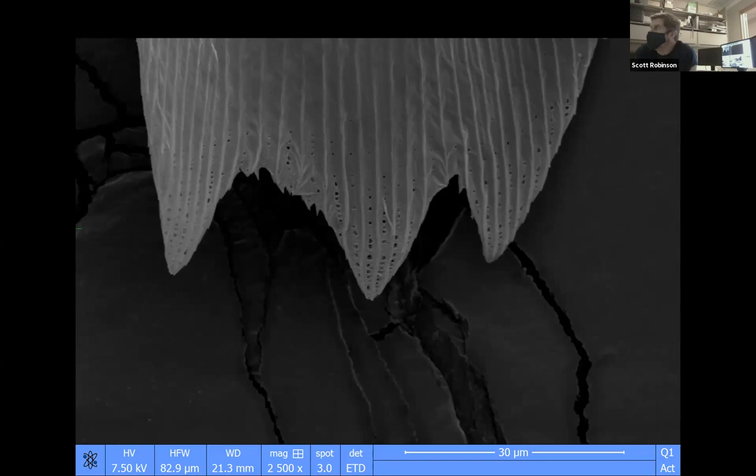So what's the area of one of these, like the average stub plate? How many nanometers would that be? Thankfully, they don't know that these things have an area. Oh. So we don't want to ask too many questions, because we might have to start measuring the area as well as the thickness of the gold palladium. But it's just the way that it works out. Maybe I shouldn't ask that question.